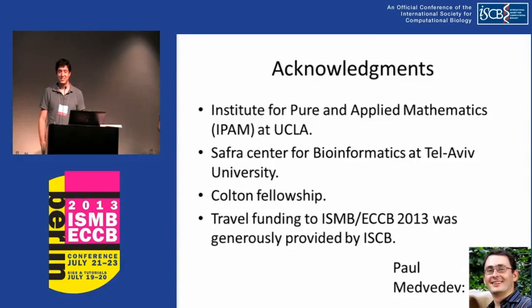Thanks for your talk. Did you try to align with TMAP, with the mapper provided by... Okay, so that's a good question. TMAP is the aligner by IonTorrent. It's more suitable for these kinds of reads. So actually we haven't. We had some technical problems with that, and we were under some pressure of time. We felt that if we align both with bowtie, it's a fair comparison, but definitely it's something that needs to be aligned with TMAP.